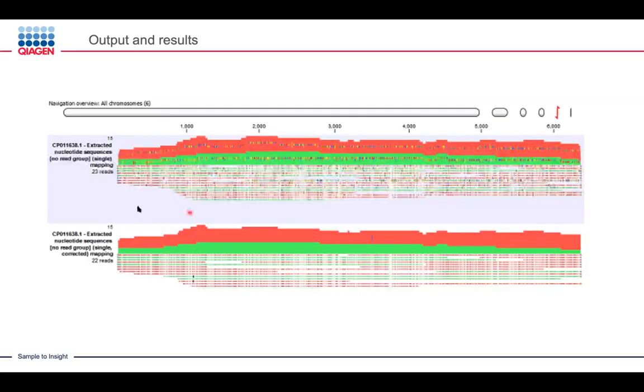And we can see that once we've done some error correction, how the assembly has been cleaned up, where it would actually be possible to call potential mutations, where we can see there's a difference in this location, a difference in this pileup of red reads. But again, what we can see very clearly is that the assembly down here has a lot fewer errors in it. And that's because we are able to use the error correction and the polishing with the short reads.